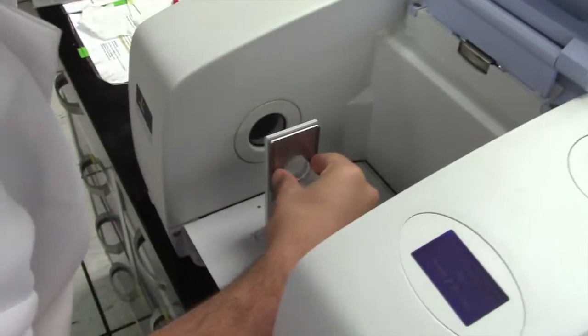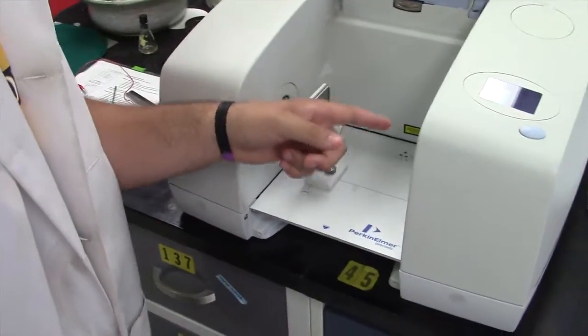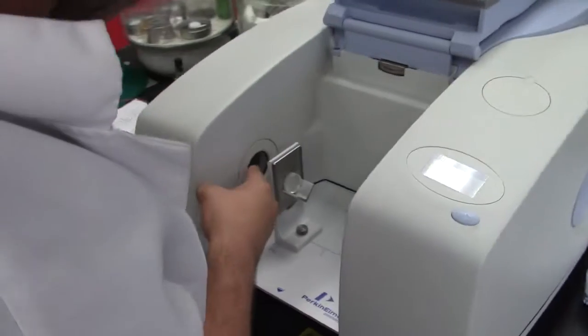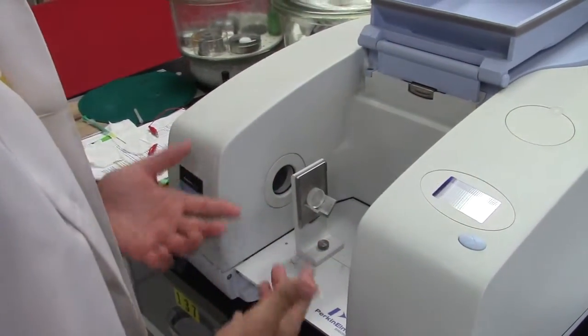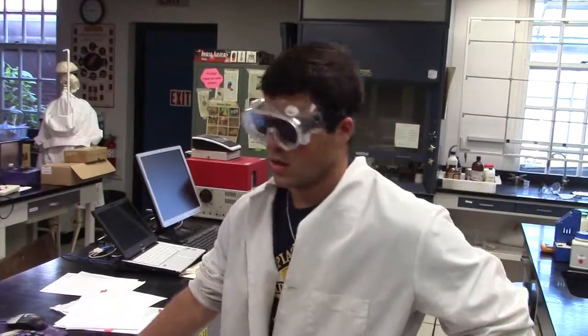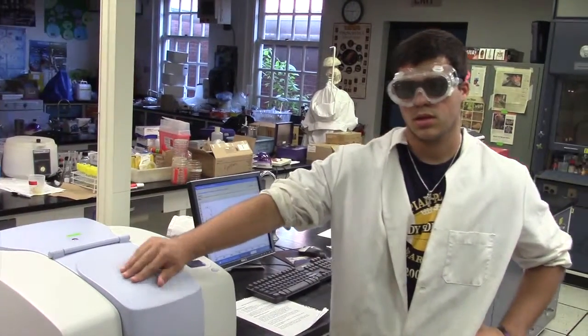And the reason why you want to put it right here is because the infrared beam shoots out from this side. It's the other side. Shoots out from this side right here, and that's how science happens. Now once your product has been properly put on the salt plate and inserted into the IR machine, you click scan to figure out what you got.